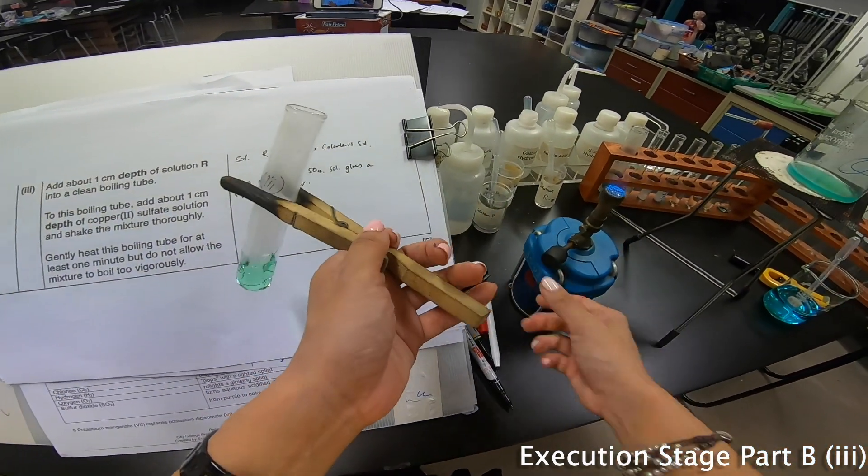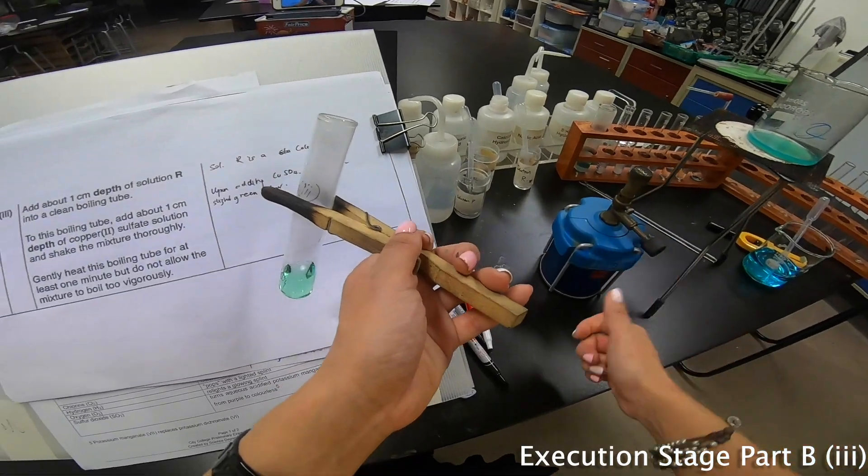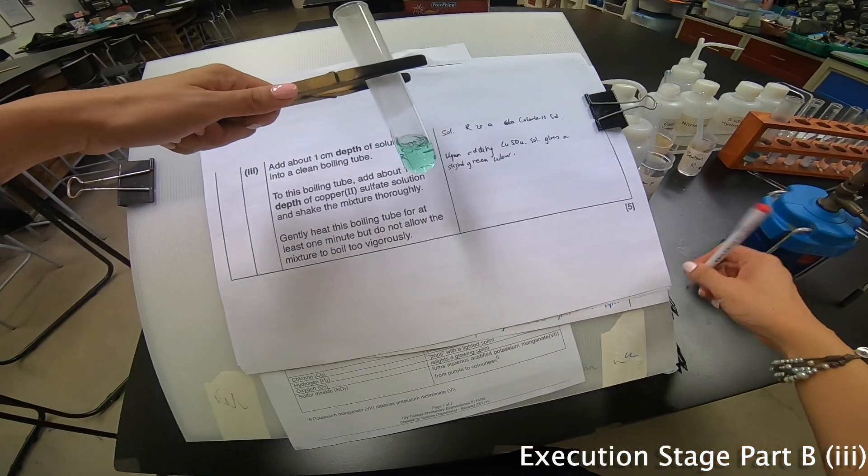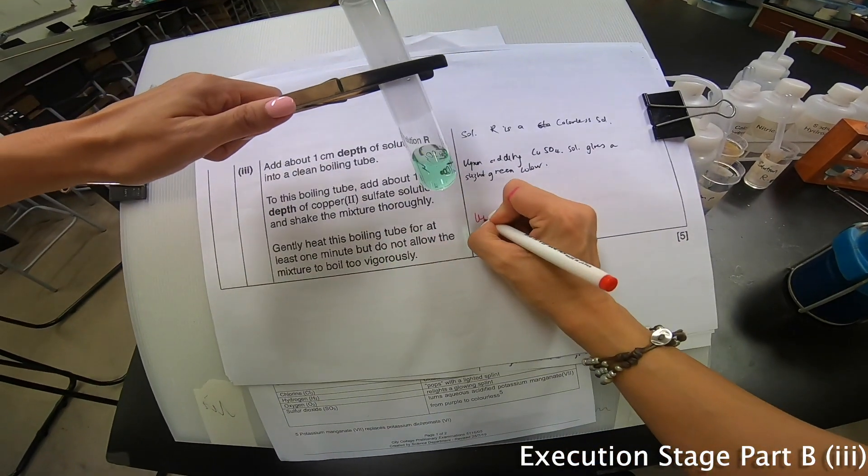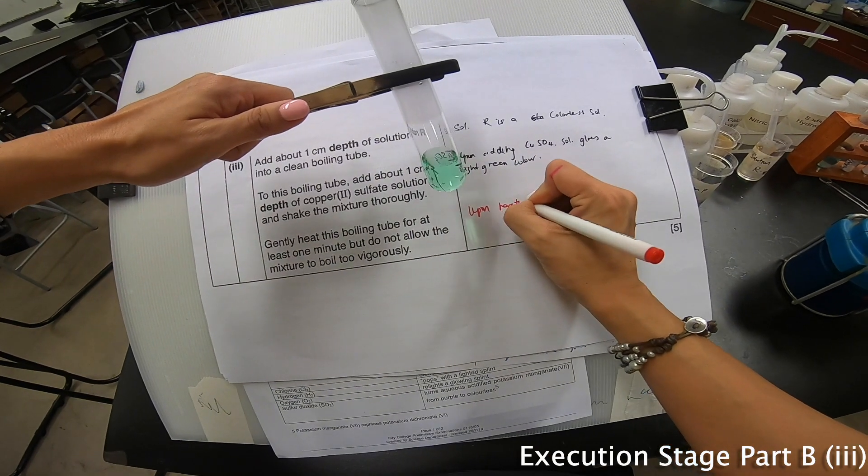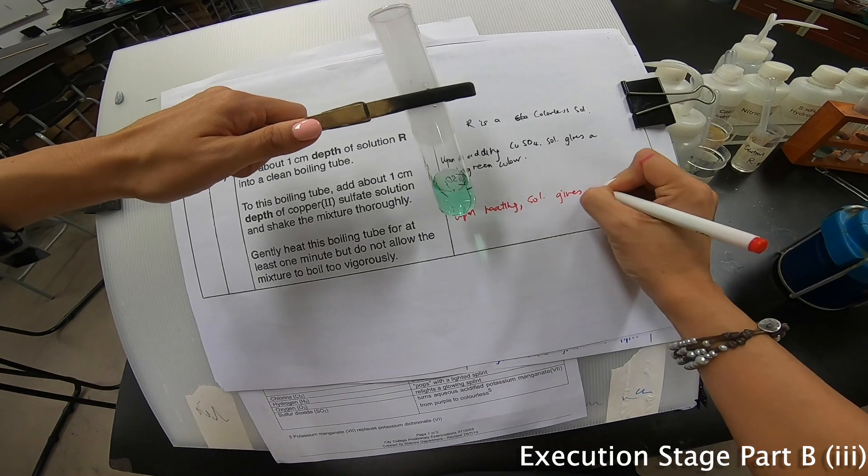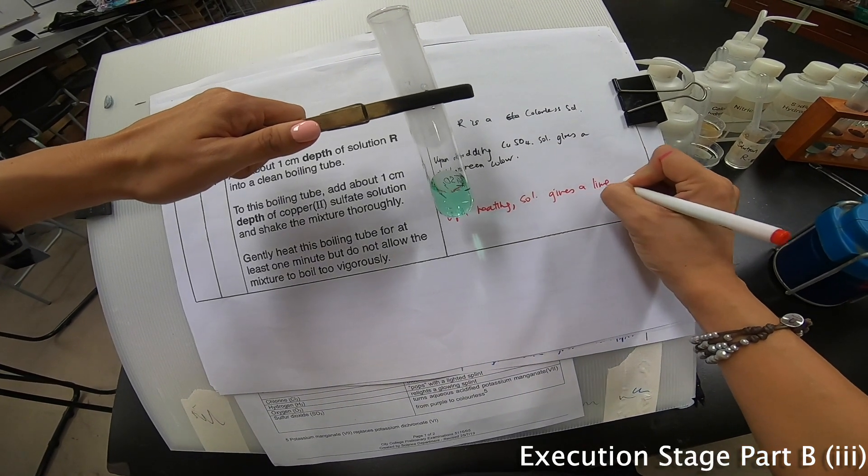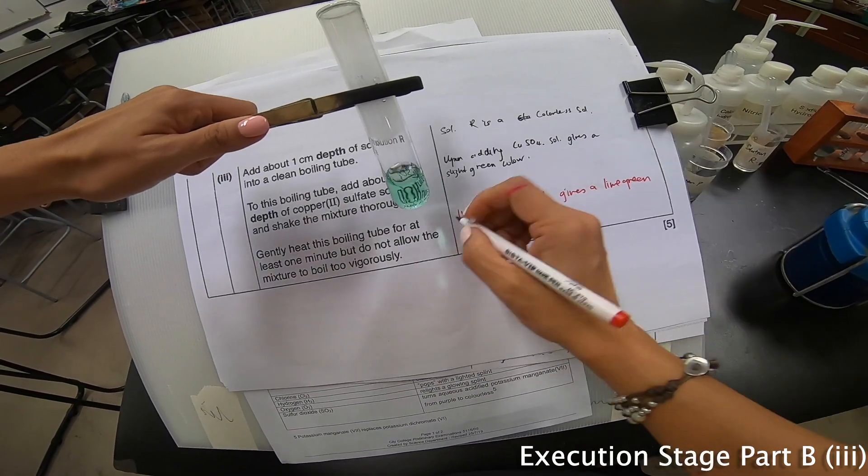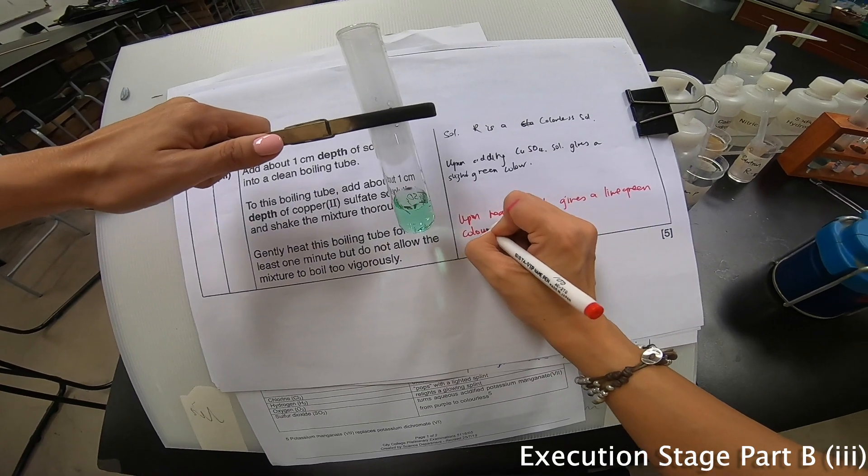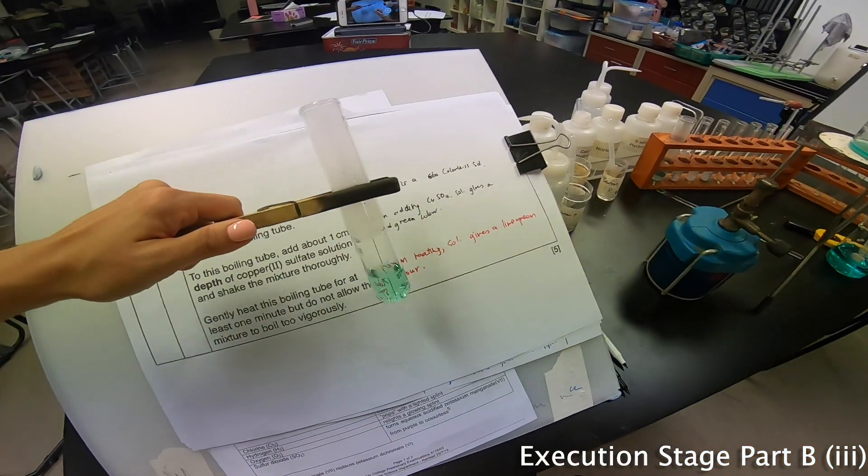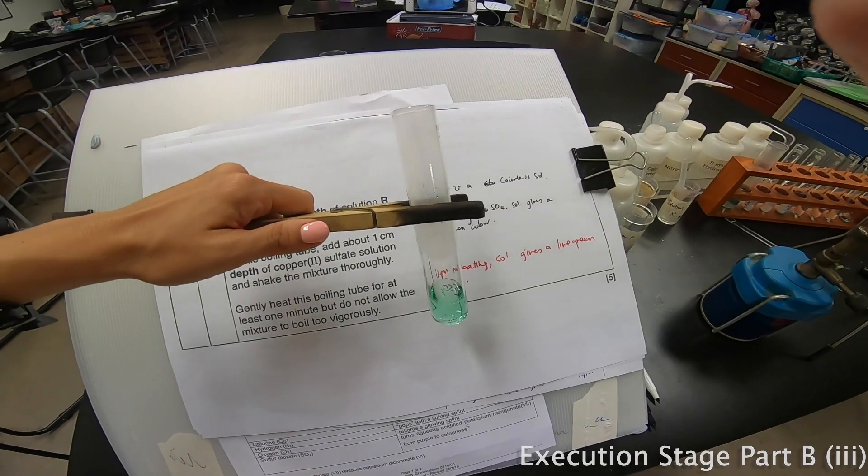I really hope that the camera can capture it because it look like lime green to me right now. And it's so lime green. Oh I really hope that you can see it because from my eye it can see so clearly. It can see so, oh brilliant, brilliant. Oh this is so good, this is fantastic. Upon heating, solution gives a lime green color. Voila, I'm happy with this. We have finished all the execution.